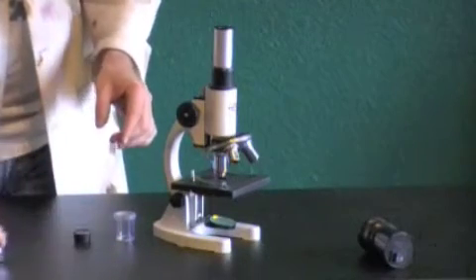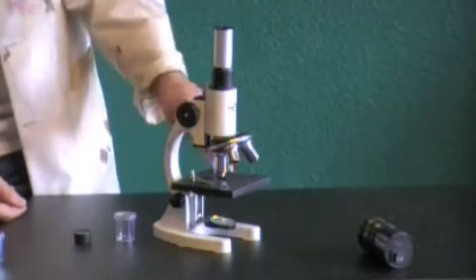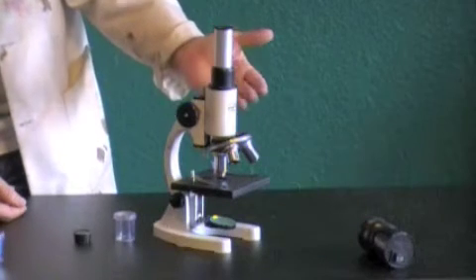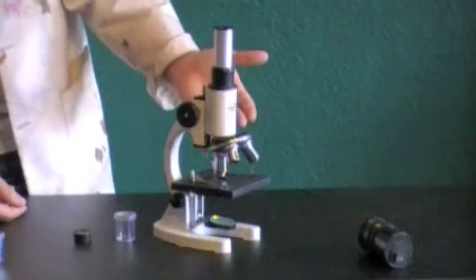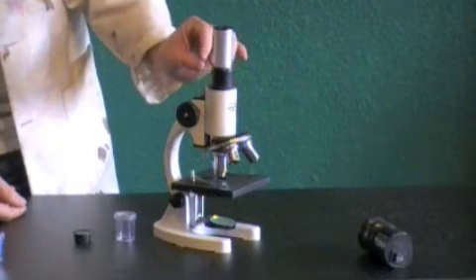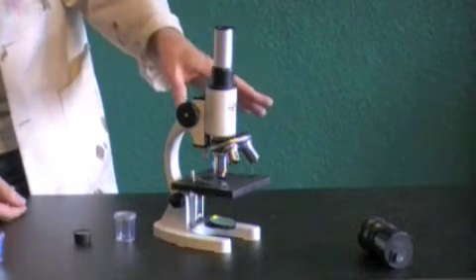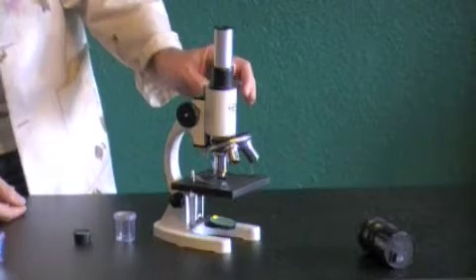Now the last thing that we need is light. Because this is a light microscope, it only works by light coming through whatever specimen you're looking at. You can't look at a rock or something with this. You have to look at something that light is coming through. So that's why it works great with liquid things, so drops of water, blood, anything like that that's a liquid thing that you can see light through.